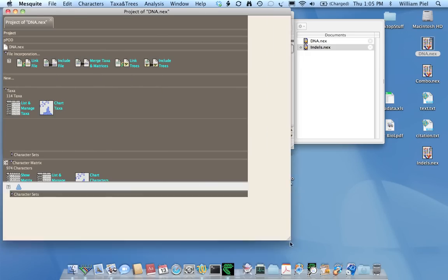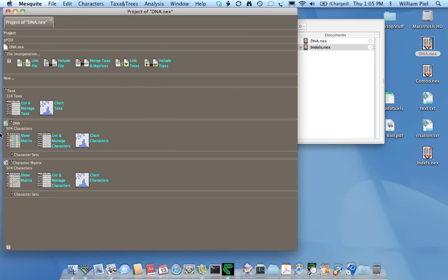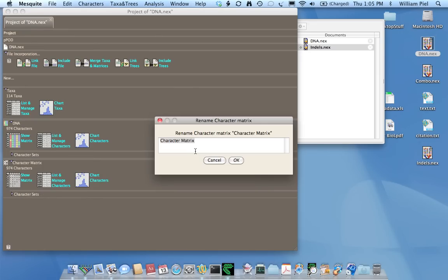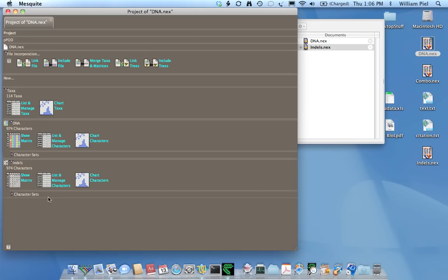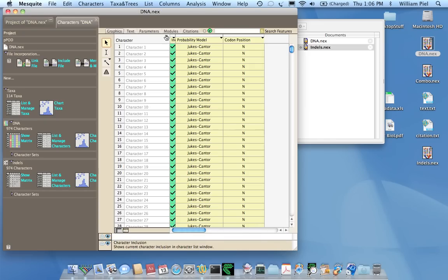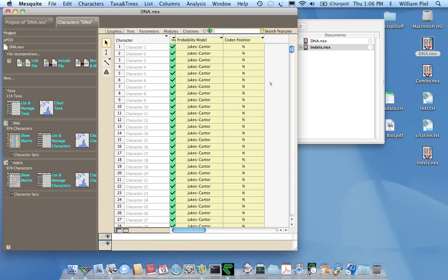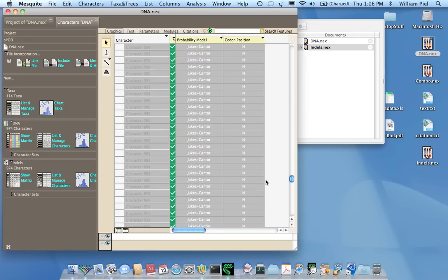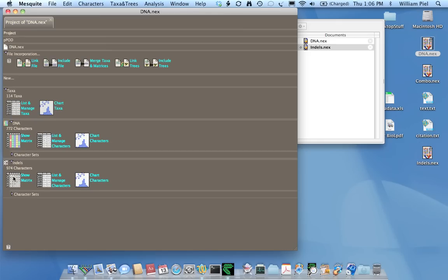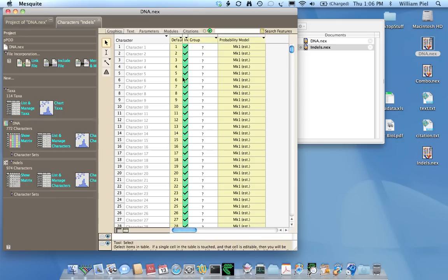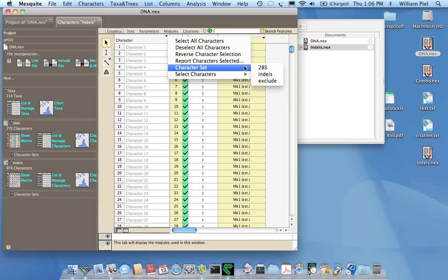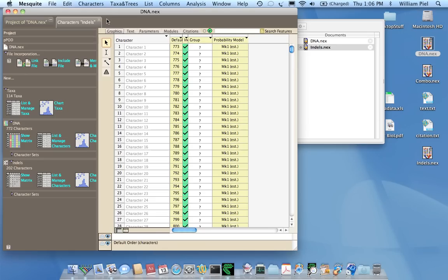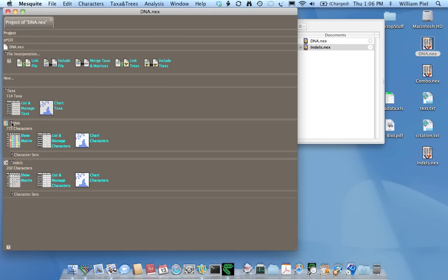So now we have a Mesquite project with a DNA matrix and an indel matrix. But, of course, now I need to delete those characters that don't belong in either character block. So, for example, here, this is the DNA matrix. I will select the set of characters that have to do with indels. So now those characters are selected at the bottom. And I hit the delete key. And I delete them like that. Now I do the same for the indels, but the other way around. I'm going to select just the 28s characters. Hit the delete key.